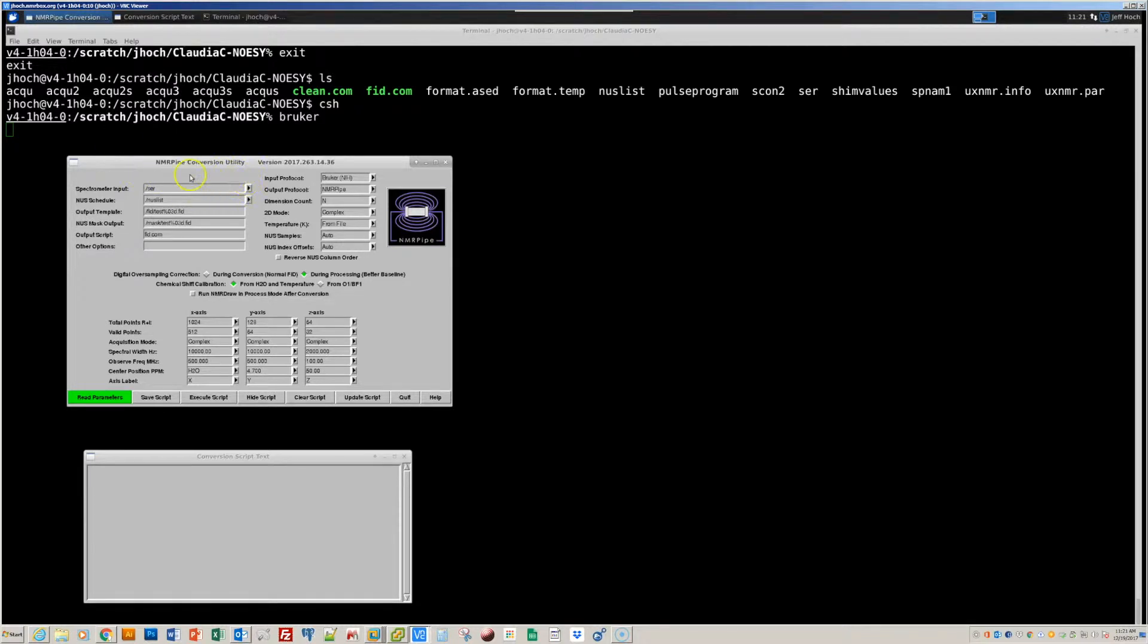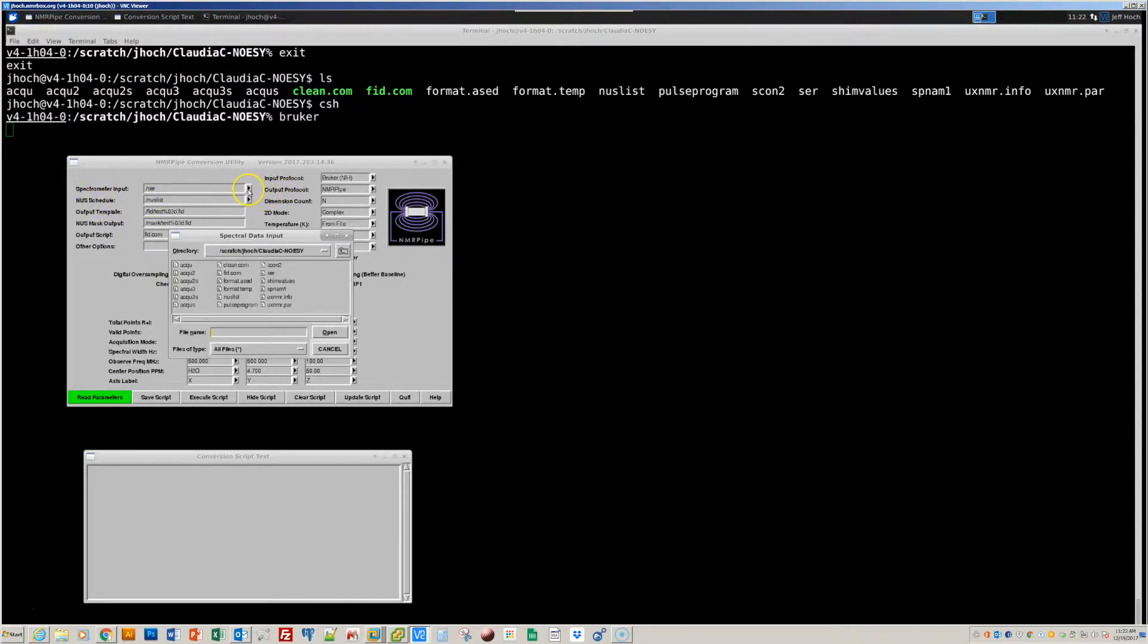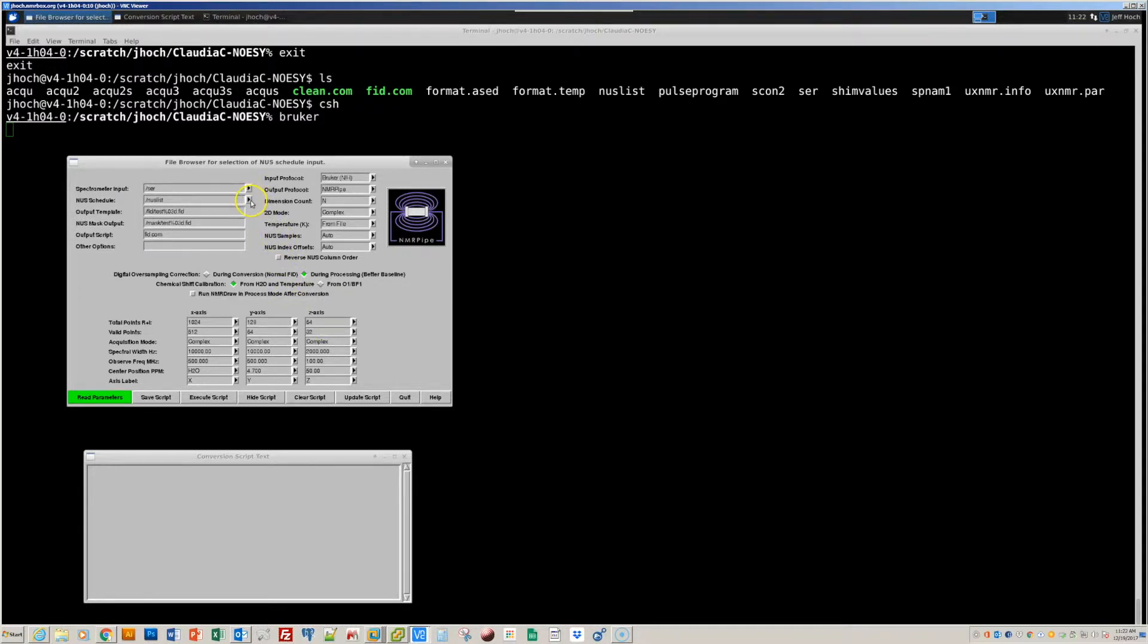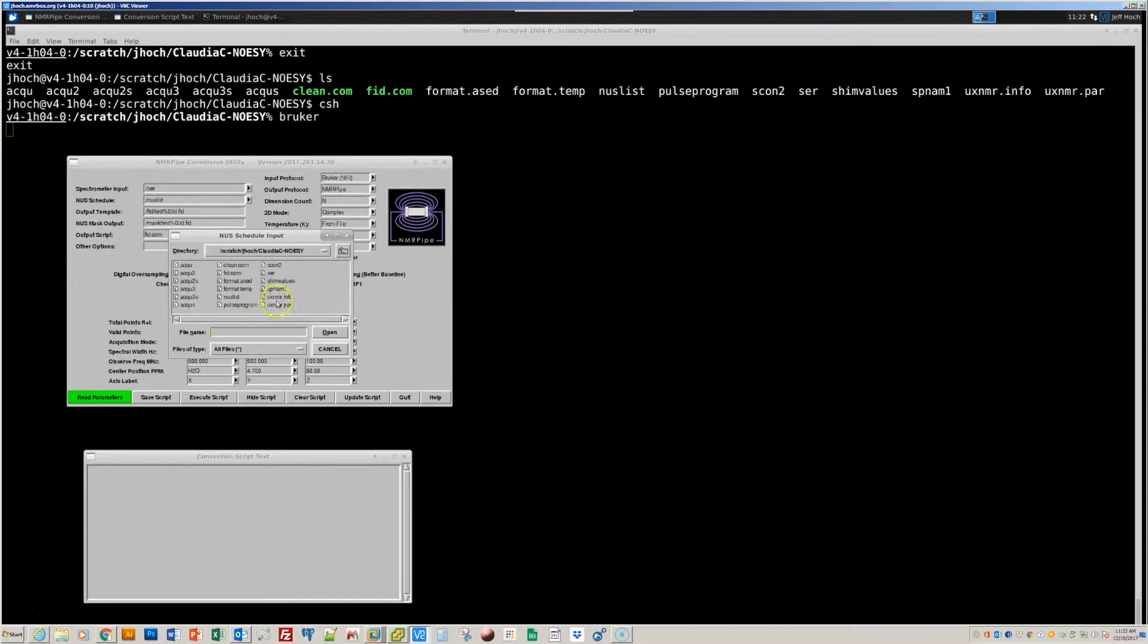As input, we have the binary spectrometer data, which in the case of Bruker data is the binary file S-E-R. And in the case of non-uniformly sampled data, we also have as part of the input the non-uniform sampling schedule, which in this case is a text file called NUSLIST. So I'll select that as input.